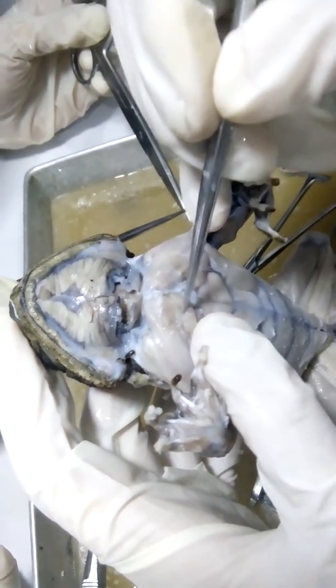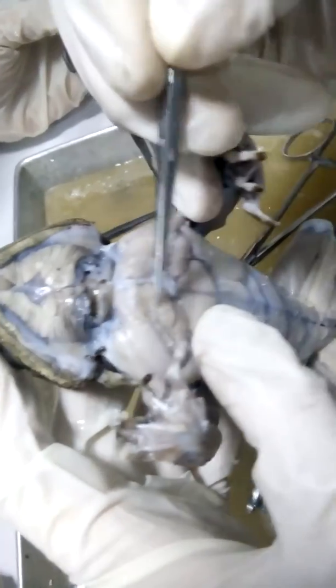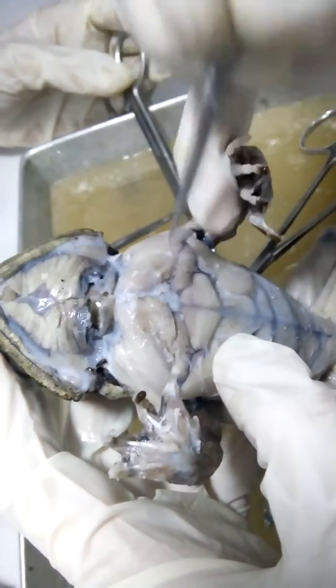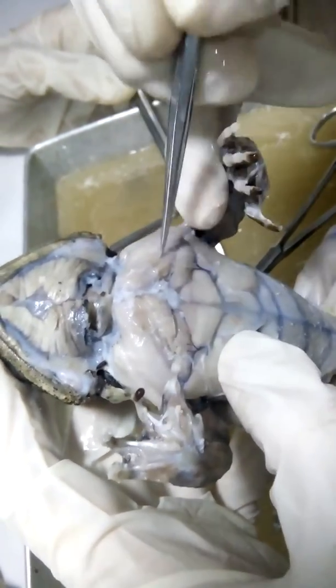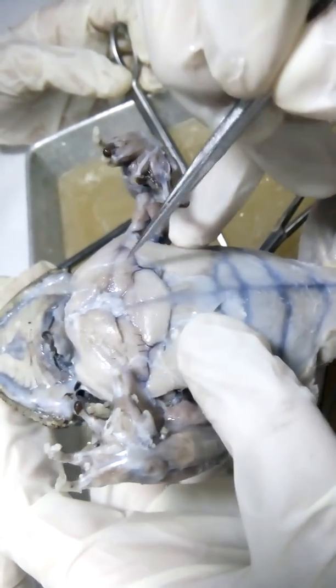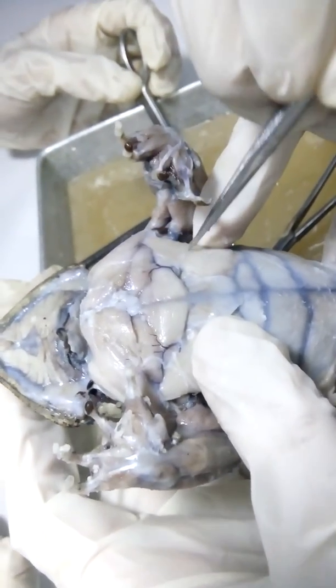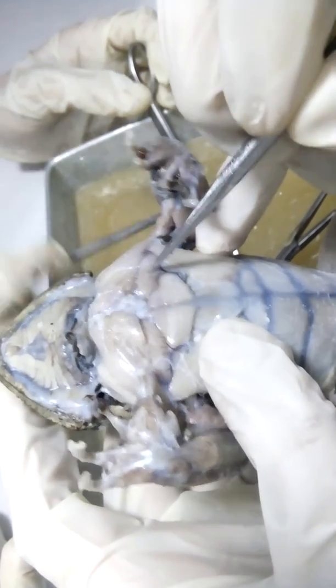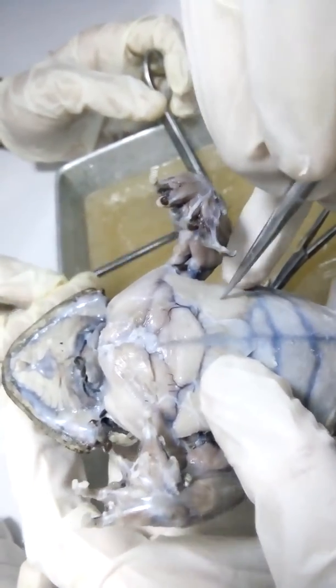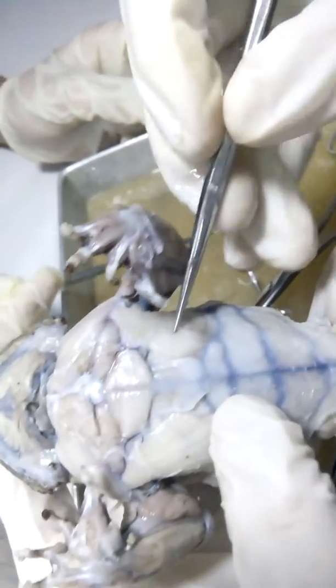So your sternoradialis is not fully covered by your deltoid ridge. So this would be your sternoradialis here. And below that, these are your pectoralis nga mga muscles. They contain three muscles: your pectoralis anterior, your pectoralis intermedium, and then your pectoralis posterior.